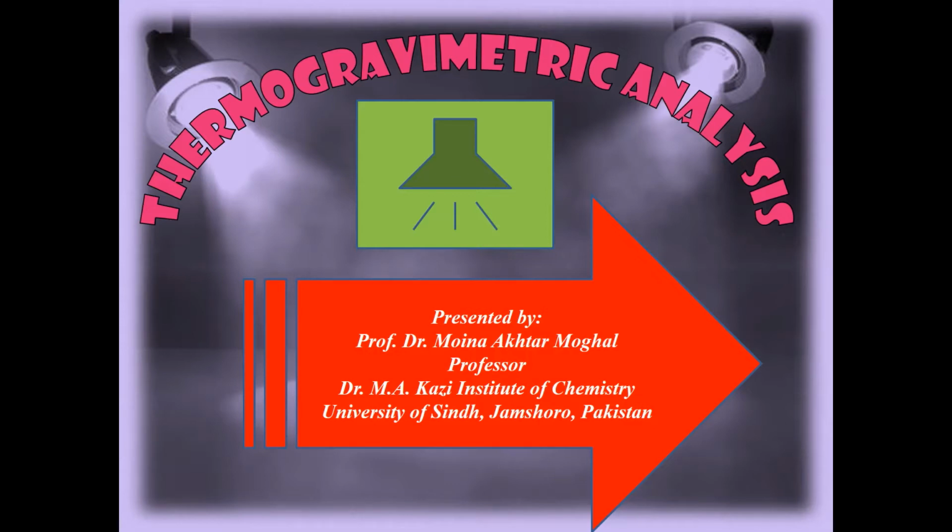The analysis is carried out by increasing the temperature of the sample slowly and plotting weight percent against temperature. Whereas DTA, that is differential thermal analysis, is almost parallel or alike DSC, that is differential scanning calorimetry.